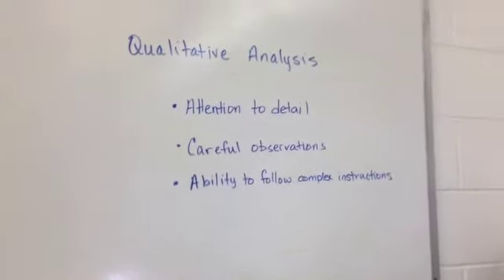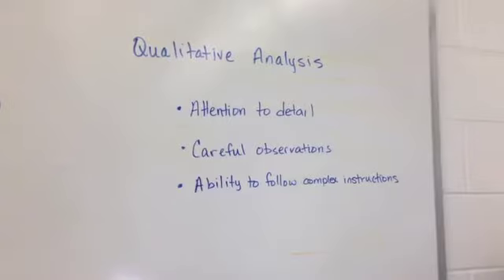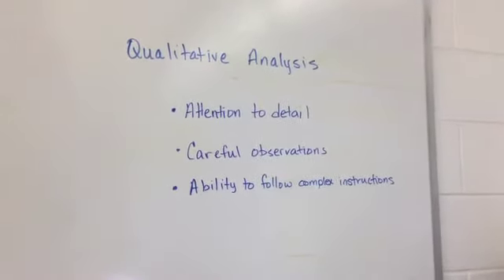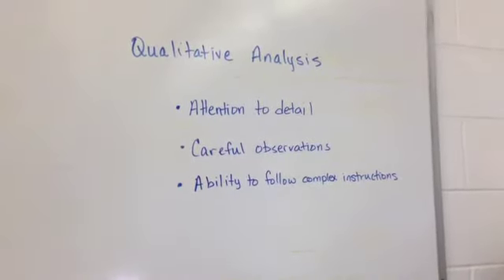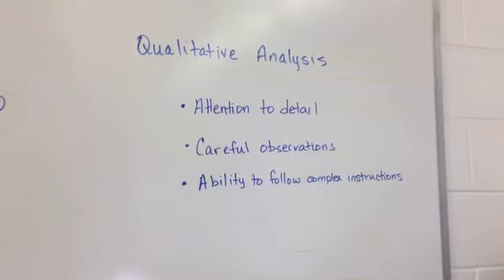Qualitative analysis is a unique lab and different from the other labs we've done this semester in that there are no calculations involved. Qualitative analysis is the analysis of trying to determine what ions are present in a solution and not how much ions are present.